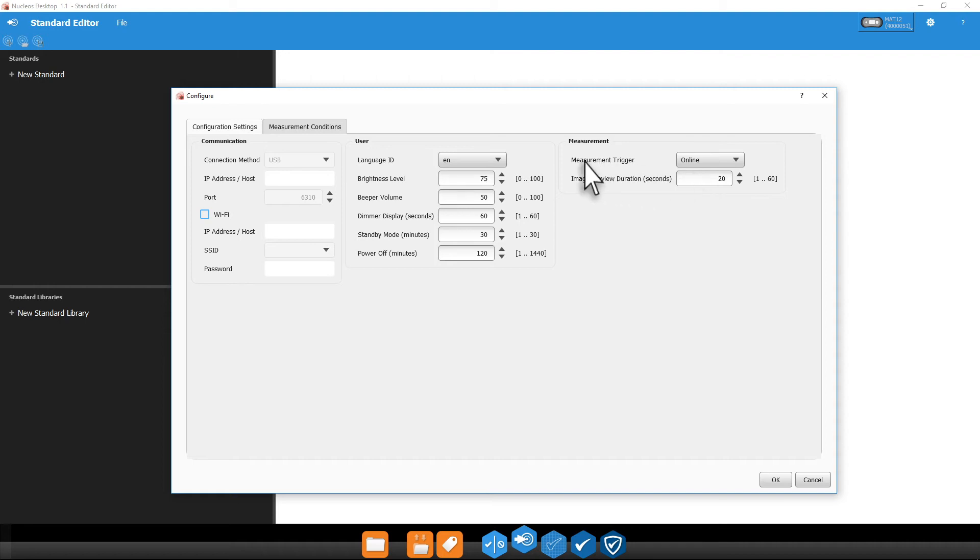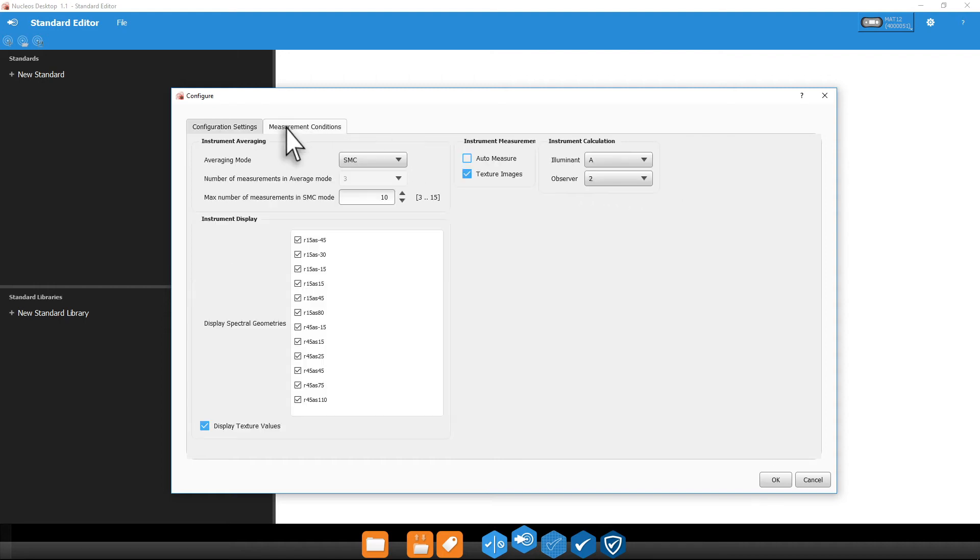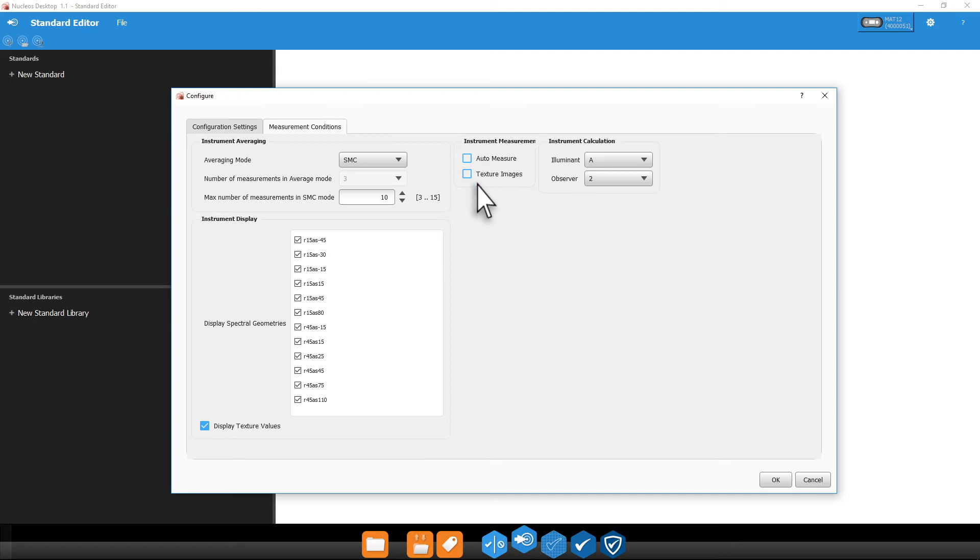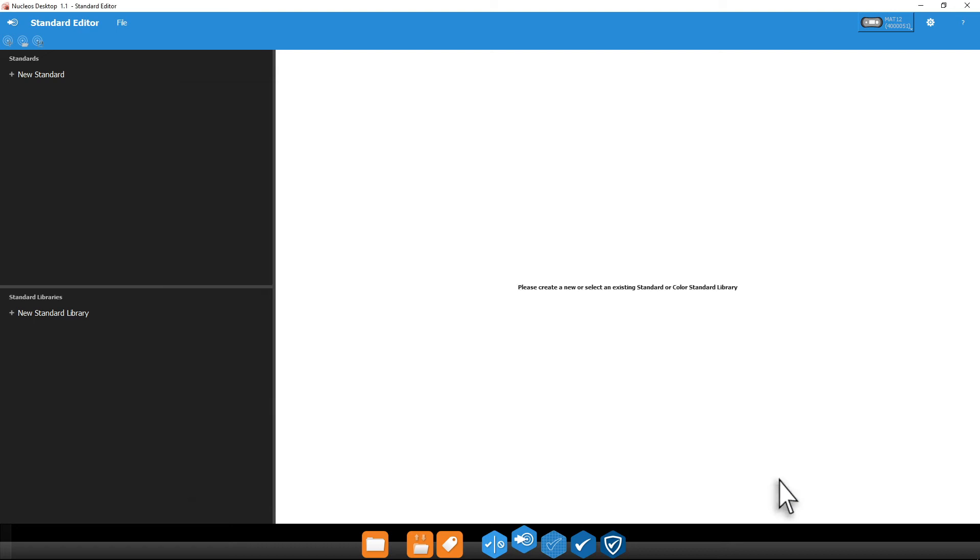Under measurement conditions, you can also uncheck texture images. The texture images can take up a lot of space in your database. These will always be saved with your standards, but you may not want an image saved for every trial you're measuring. Click OK once your settings are set.